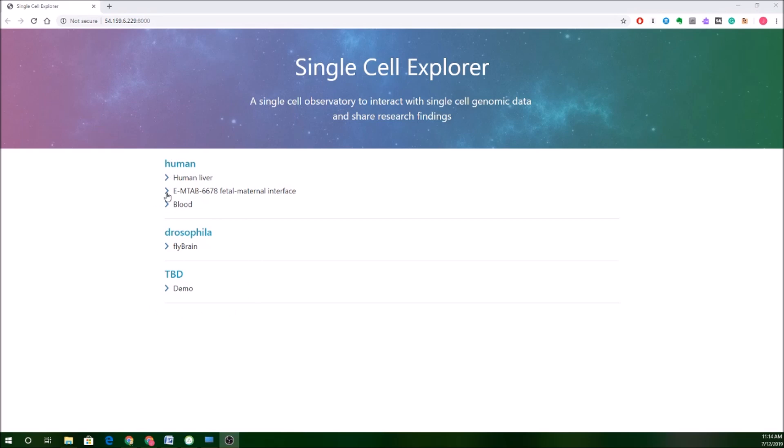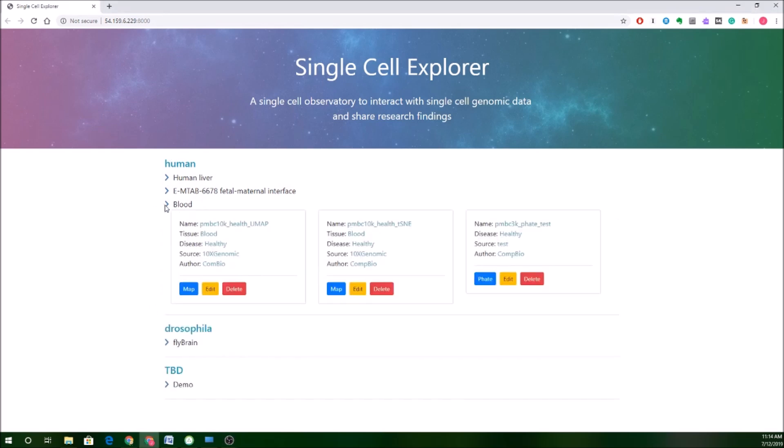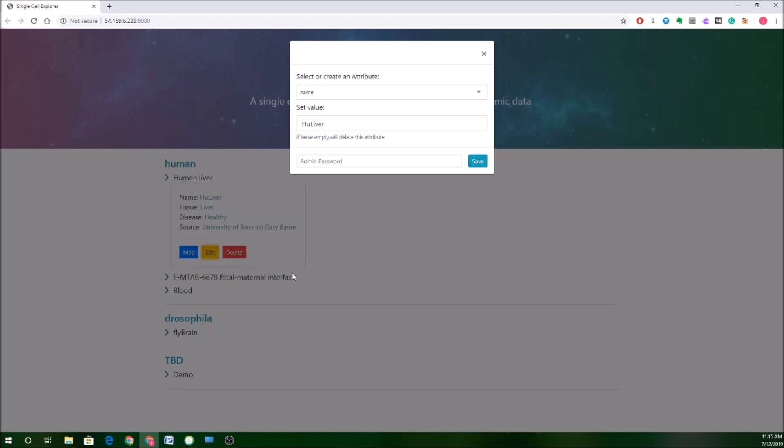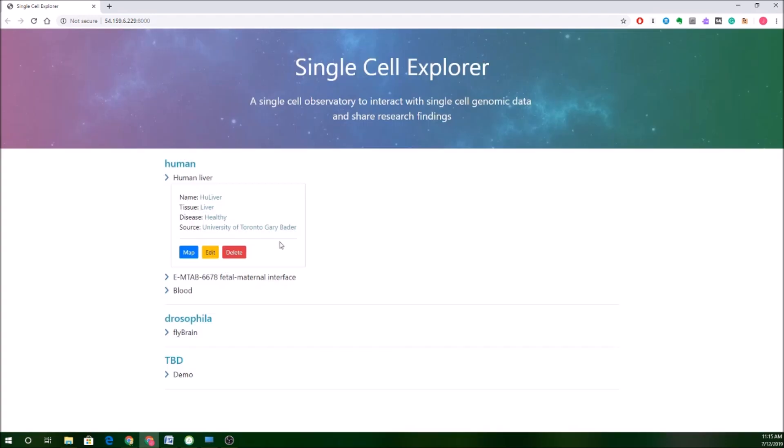As you can see, there are different options. So if I click through to this collection of blood studies, you can see here that there's actually different studies, and they're also separated by the type of representation that are being used. So here we've got a UMAP version of this PBMC data, and here's a TSNE version. Now, what you can do here, I'm going to actually go up here and select this study from the Bader Lab, which is based on the human liver. I can jump directly to the map by clicking on this blue button.